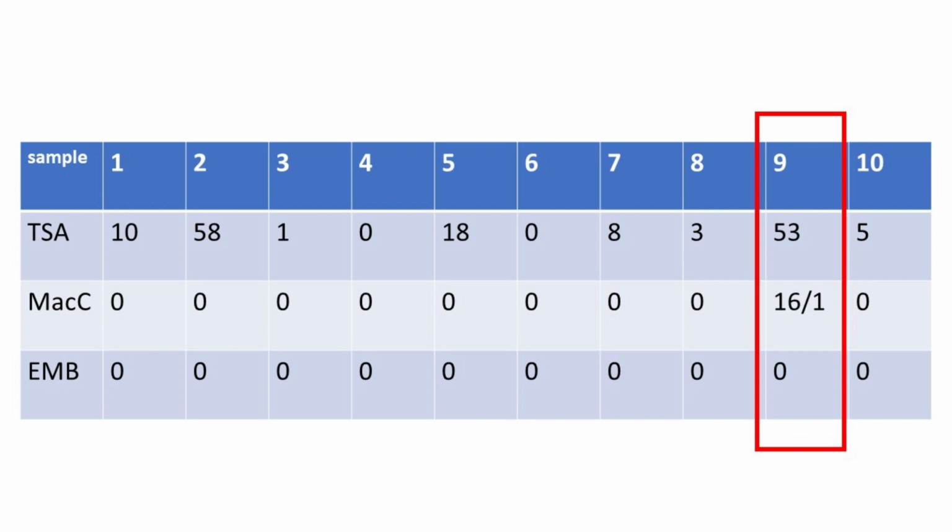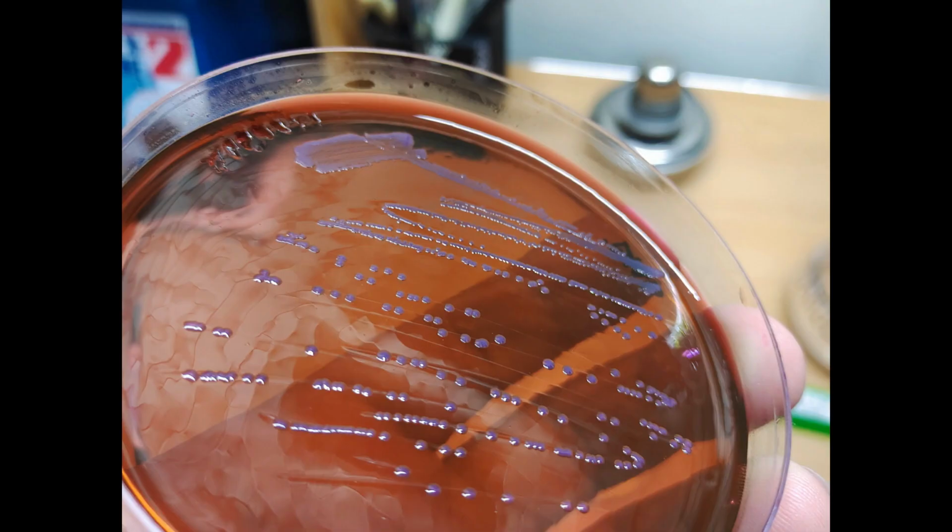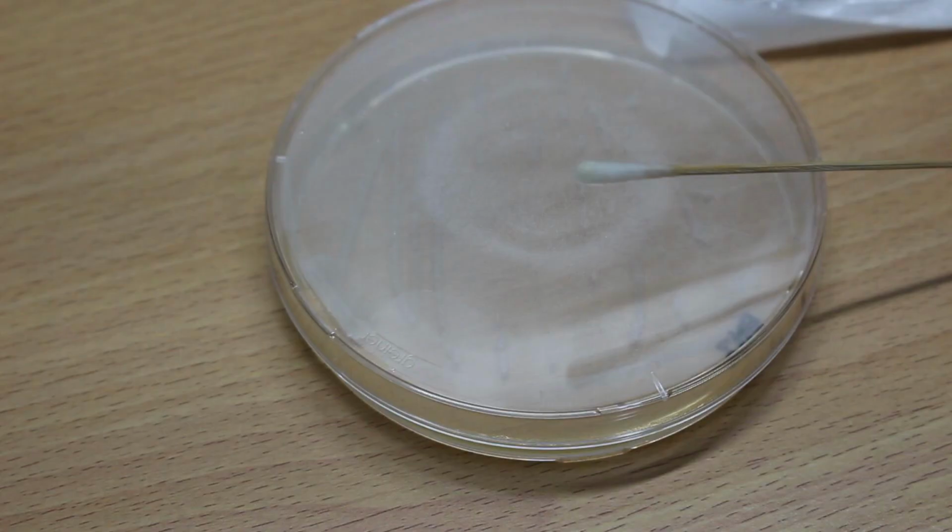The only sample with gram-negative bacteria had only one colony showing carbohydrate fermentation, and EMB culture shows that it was not lactose fermenting. Also, this colony was oxidase negative, indicating it might belong to the family Enterobacteriaceae.